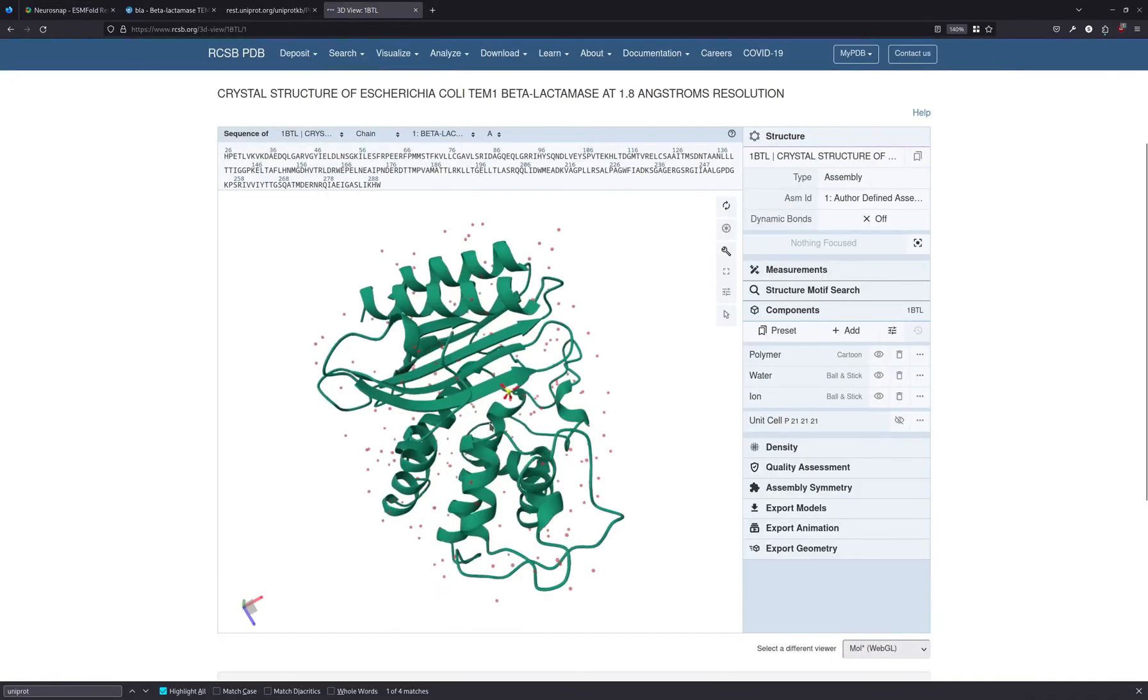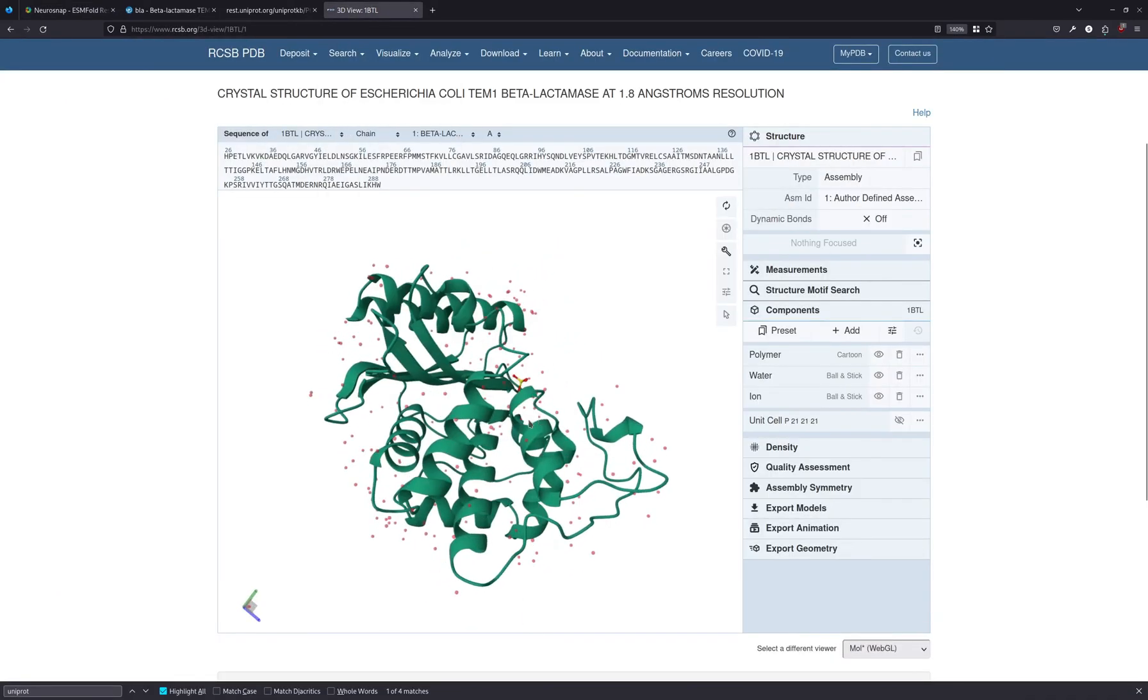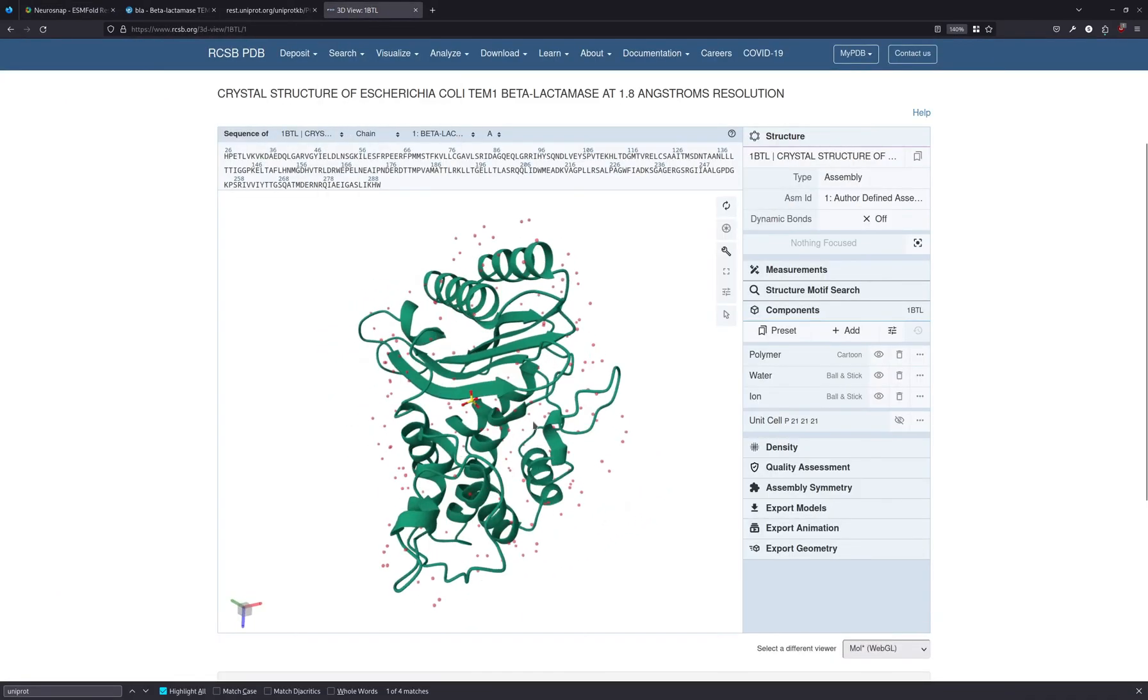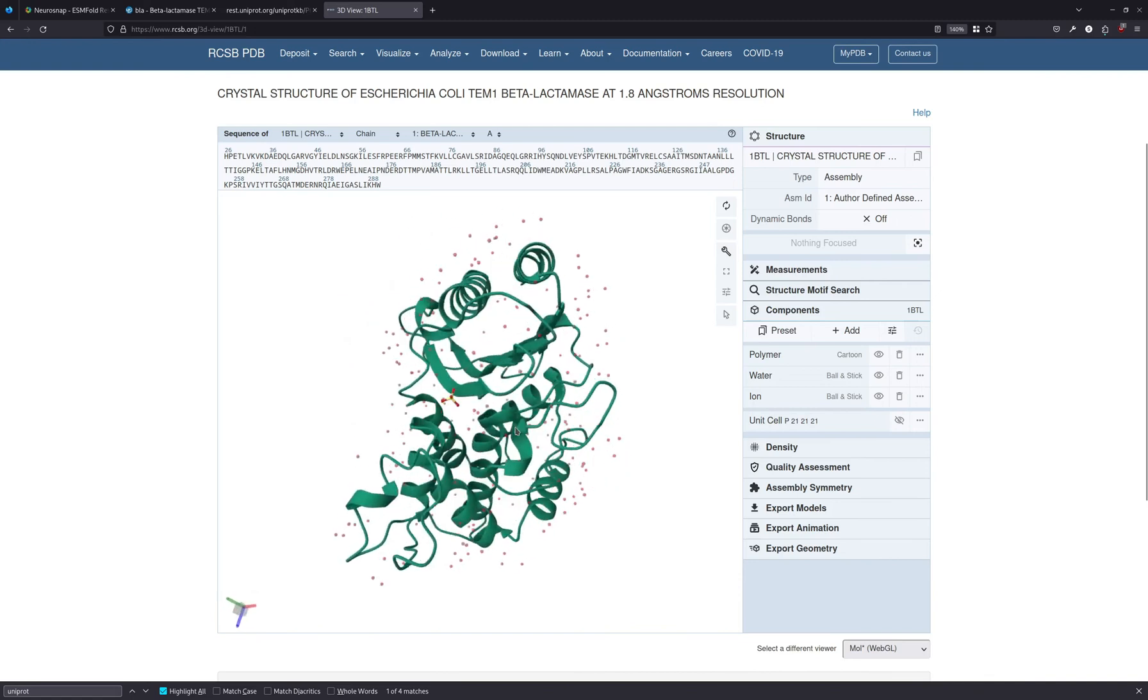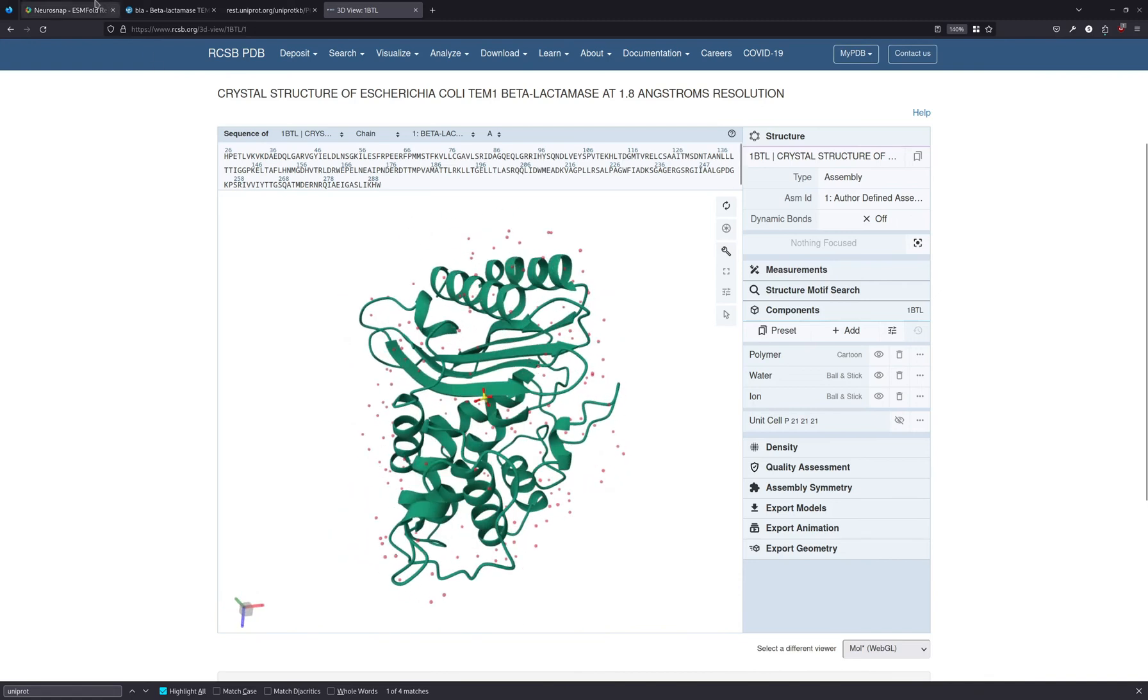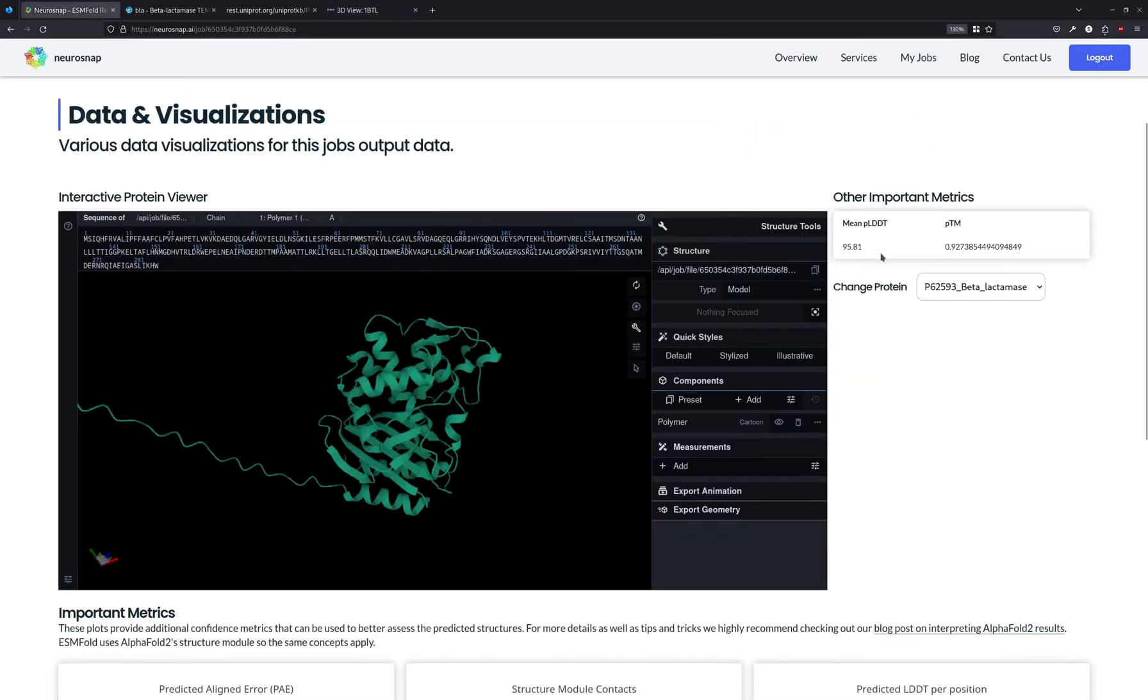If we compare it to the experimental structure in the PDB, you can see that it's quite similar. So we know that the prediction is good.